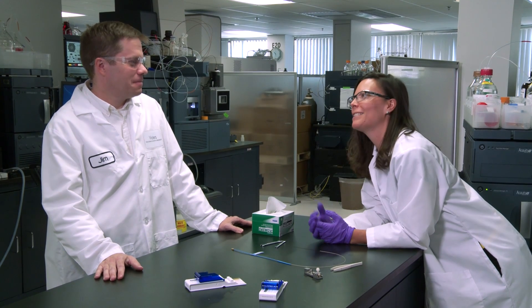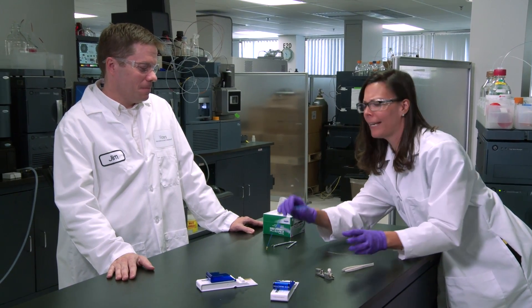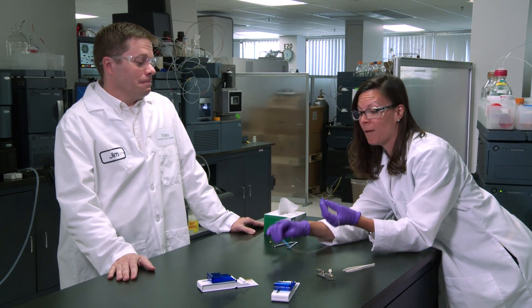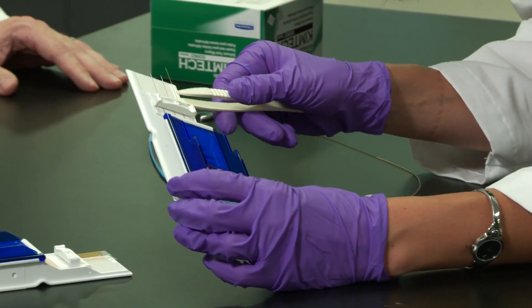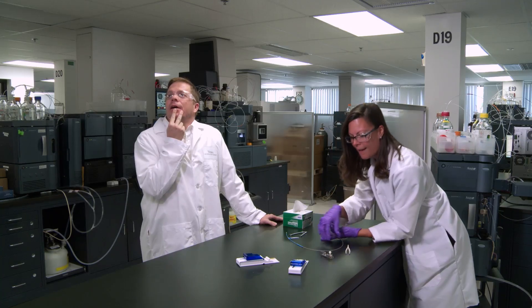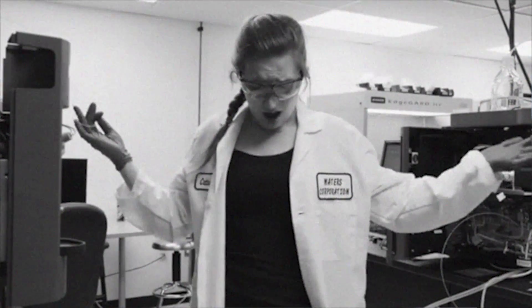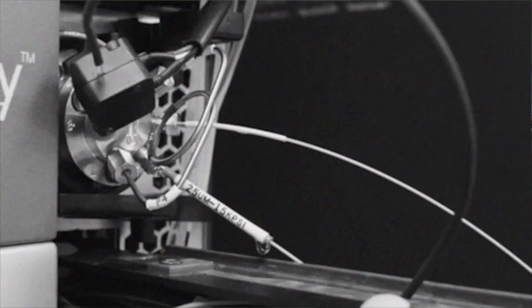Jim, remember the good old days of microflow where we had to cut our own capillary columns? I was terrible at that. And then you had to take these delicate glass emitter tips and try to get them out — you can barely see them anymore. And then you'd have to put them into the sprayer, and big trouble if you ended up breaking off that tip.